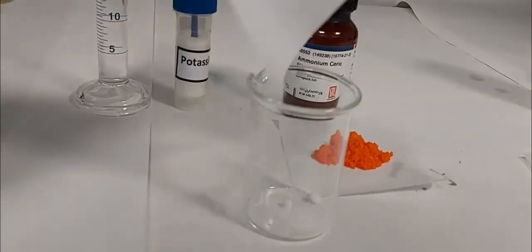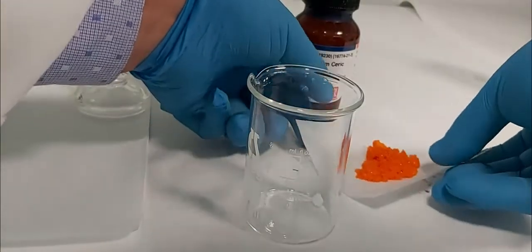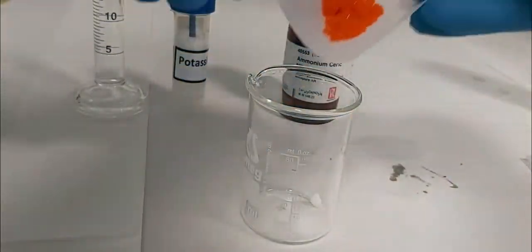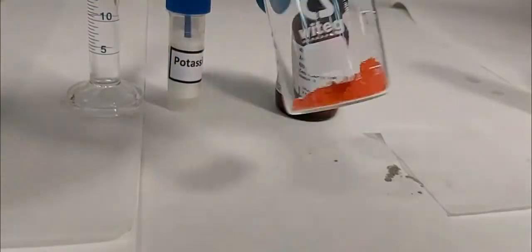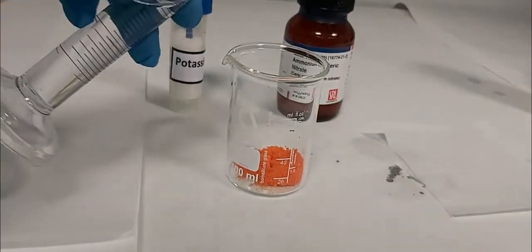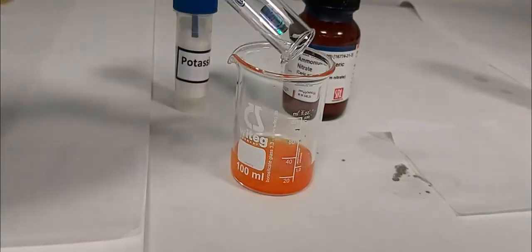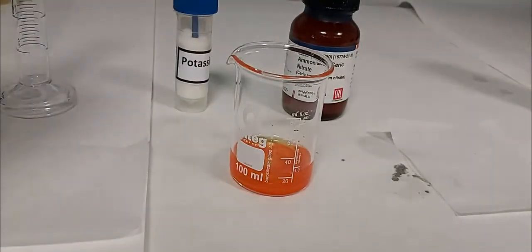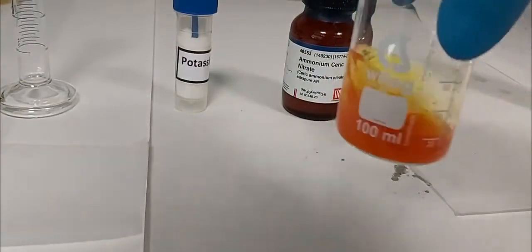We add the potassium bromide and ammonium ceric nitrate all together in the beaker, then 15 ml of water. We stir the mixture until complete dissolution.